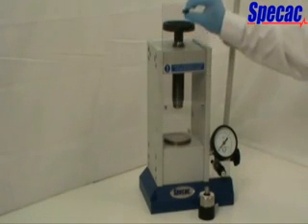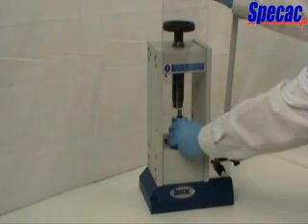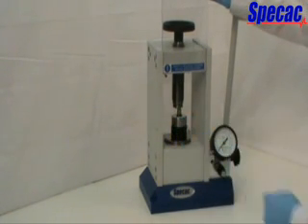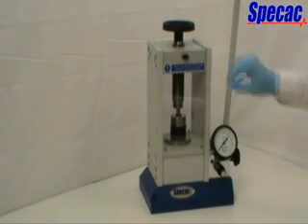Raise the front safety guard and place the die to be pressed on the lower bolster pressing face covering the piston. Ensure that the work is positioned centrally and lower the safety guard.